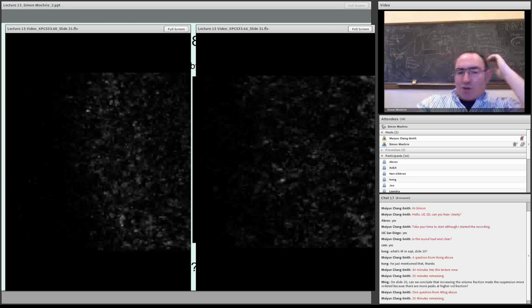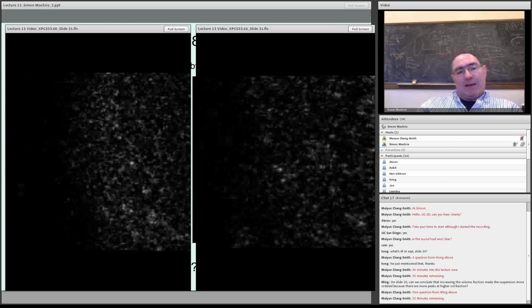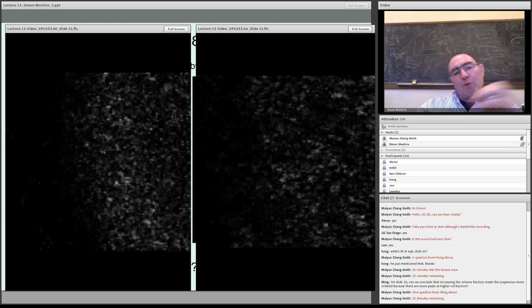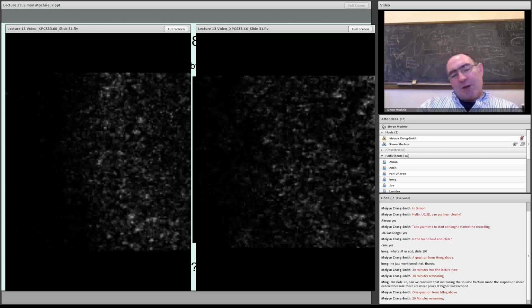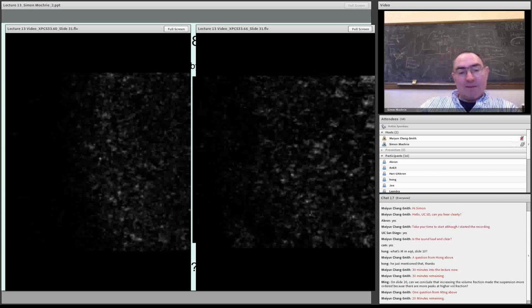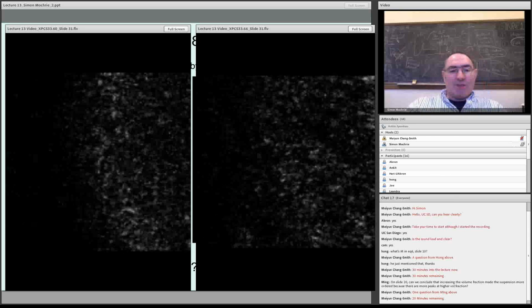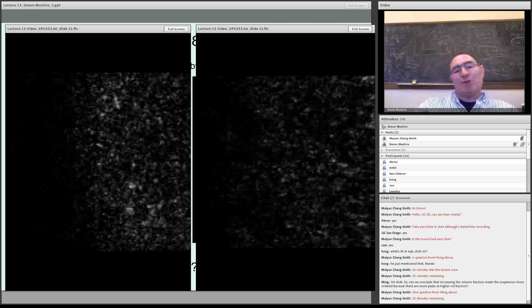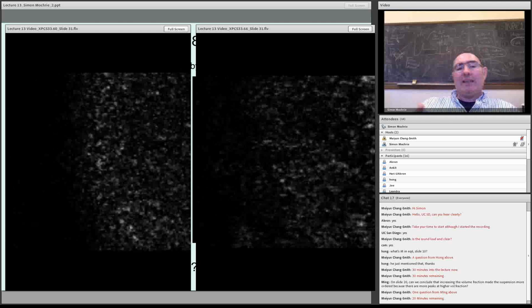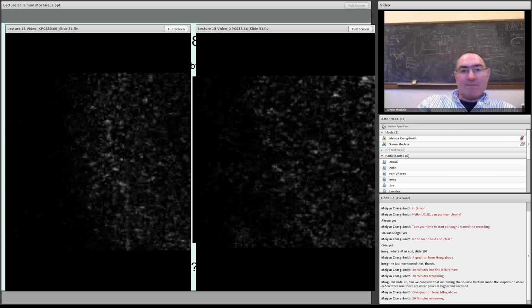By contrast, on the left, the speckles are there for a minute, then they're gone, a new one appears, it's gone, and so on and so forth. So in this case, the sample is moving, and this therefore is a liquid. So hopefully you can see that, but this is the basis, directly in the data, for the difference between a liquid and a glass.